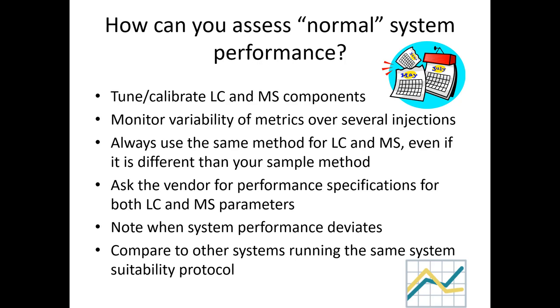And if you're doing high flow, you take the output before it goes into the column and stick it in a graduated cylinder and set your timer. And then you can tell if pump A is pumping what you think it is.